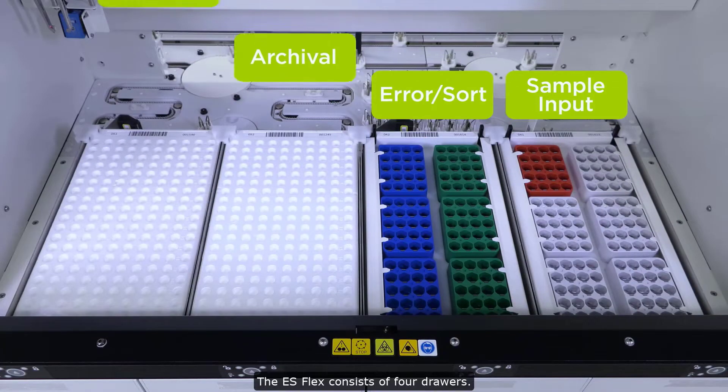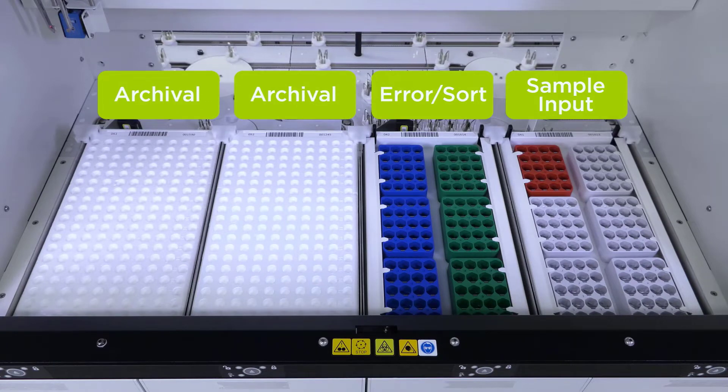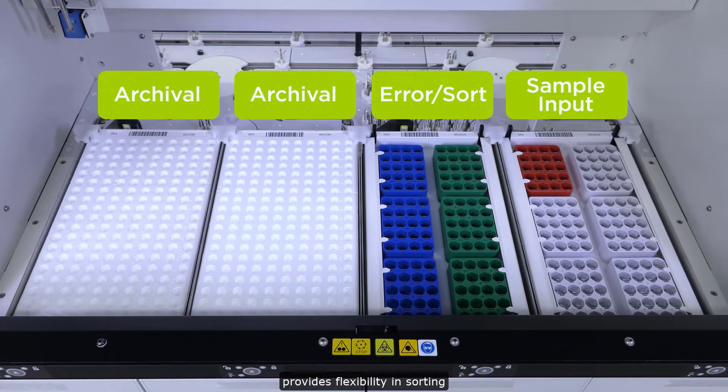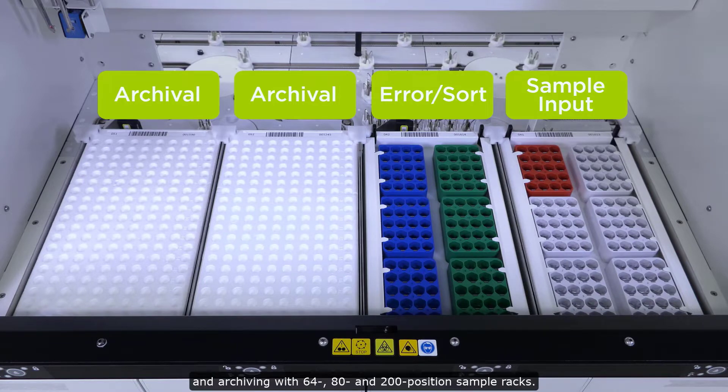The ESFlex consists of four drawers. A combination of racks and trays provides flexibility in sorting and archiving with 64, 80, and 200 position sample racks.